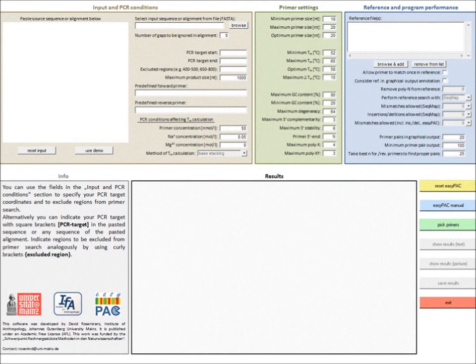Here you can see the EasyPack user interface which is divided into several sections. The brown section is where you can paste your alignment or alternatively select a file that contains your alignment and adjust some PCR conditions. In the green section you can adjust the primer parameters, and in the blue section you can optionally choose an arbitrary number of reference files and adjust some parameters for the mapping process.